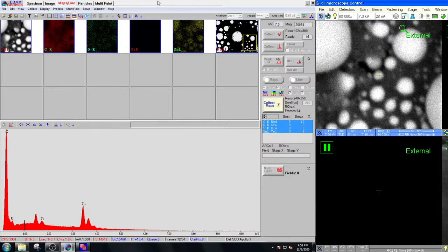And the smallest ones I can see, I can see this guy pretty easily. That's this particle right here. I can barely make out this particle. There's a little fuzzy thing right there, but it's not super clear.